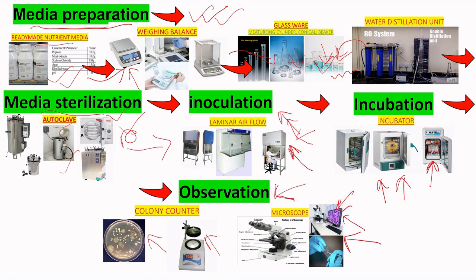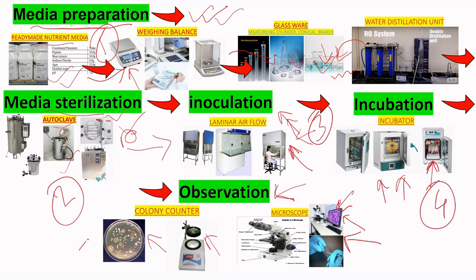Okay, so this is the whole process. The first step is media preparation, the next step is media sterilization, the third step is inoculation, the fourth step is incubation, and the fifth step is observation. So these are all the steps of a microbiological lab for microbiological analysis.